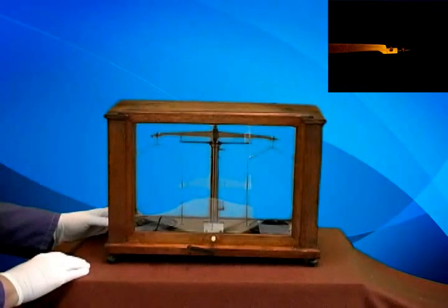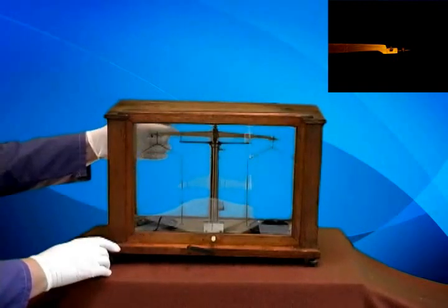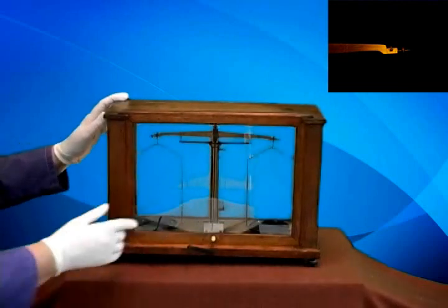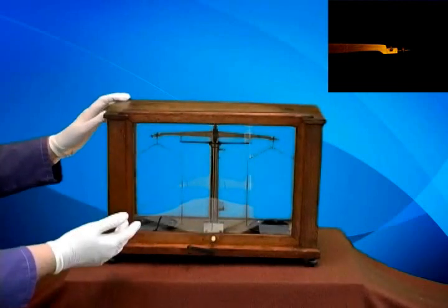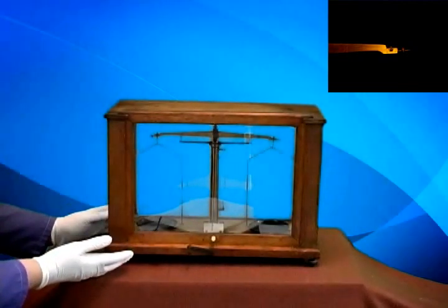Let me show you some of its features. First of all, it is in a case of glass so that you can see inside of it, but air currents will not cause the pans to swing back and forth.